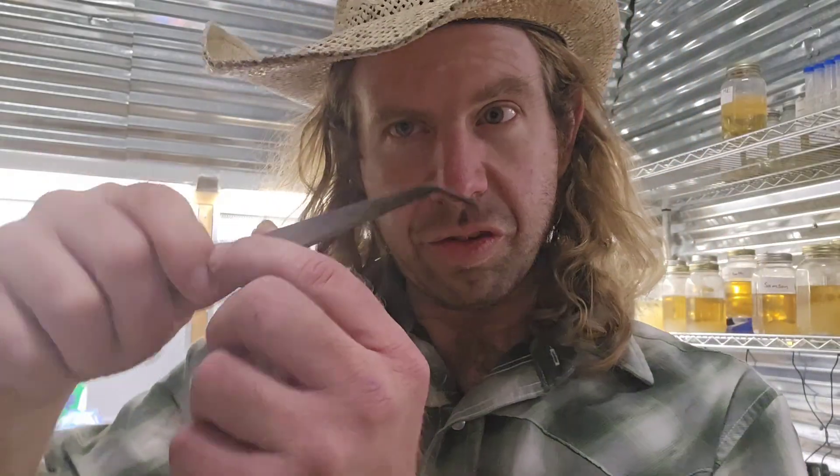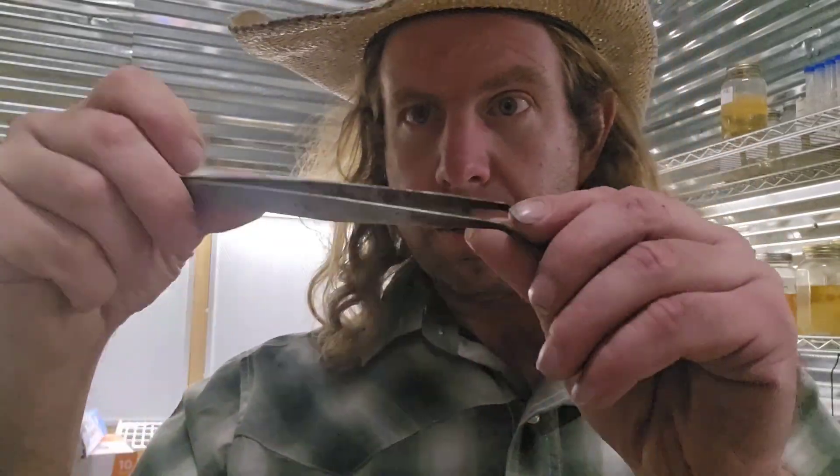Number twenty-one: tweezers. Every good mycologist is going to have a set of tweezers. This is great if you're doing some cloning and you want to take a little piece of tissue and put it on a petri dish, or maybe take a little piece of grain and put it on a petri dish. When you've got to pick up something small, it's nice to have little tweezers. Number twenty-one.